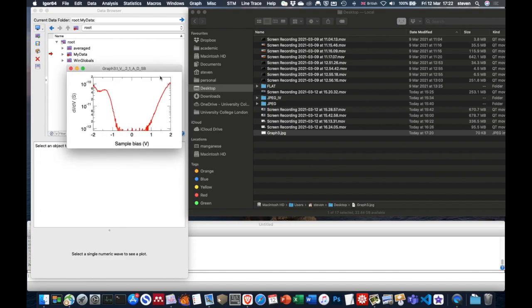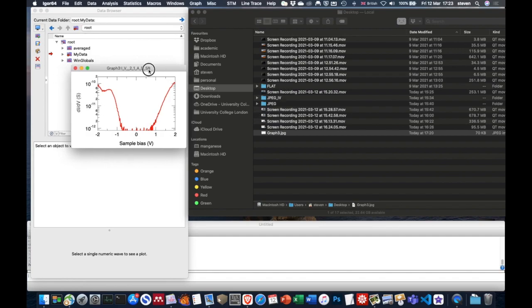Okay, but that shows then this measurement of those first initial 50 or 51 measurements that we made. This is fairly reasonable. We've got a valence band edge here. This is now the imaging into the valence band, conduction band over here. As I said, if we had done the measurements a bit more sensitive, I would have expected a flat region here down to 0.